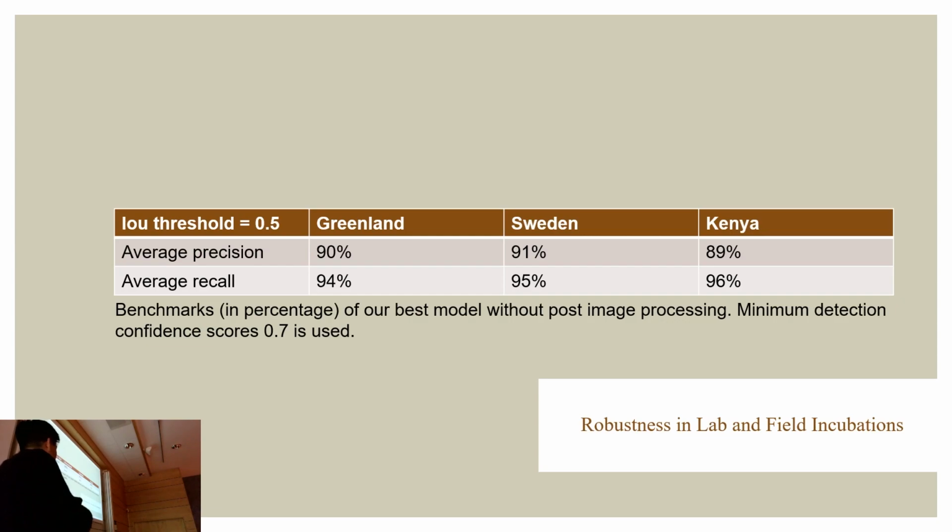Like I mentioned before, when students count, some tend to count more of the slightly out of focus ones because they're easy to identify. Some consider, oh, this is maybe a bacteria, this may not. So there's a huge difference. But now we have more consistency here.